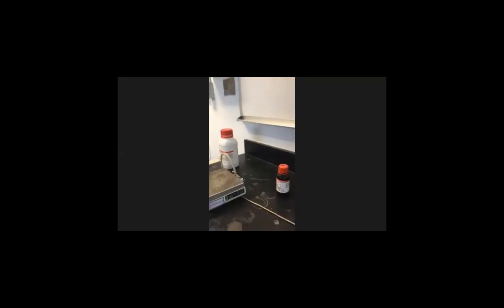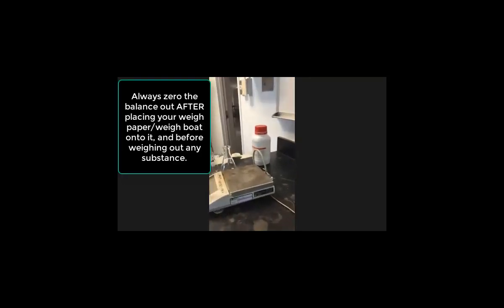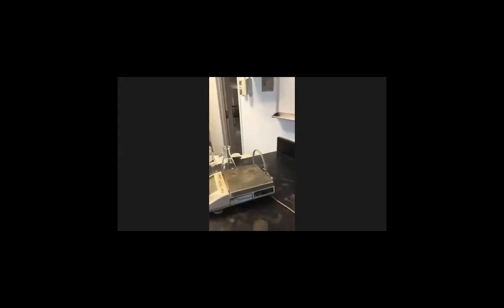But if you were doing a recrystallization, you would not want your stuff boiling. But this, you want boiling. All right. So we're going to heat that up. And while that's heating up, we're going to come over here to the balance. We have the balance. We have salicylic acid, which is right here. Let me get the camera. I need everybody that's zooming, everybody that's here, look on the handout. You see that block that says molecular weight for salicylic acid? Put this number in there.